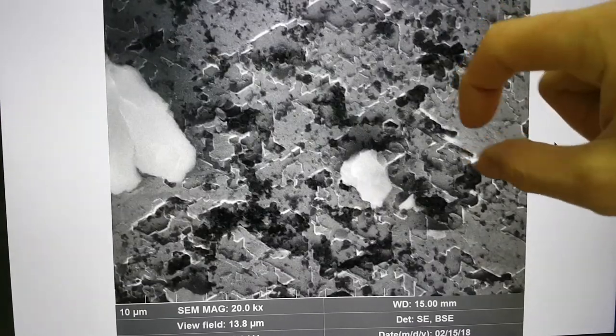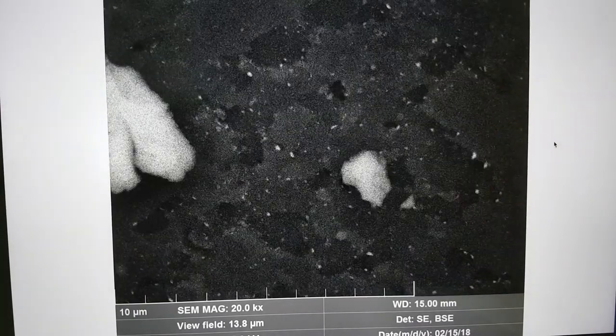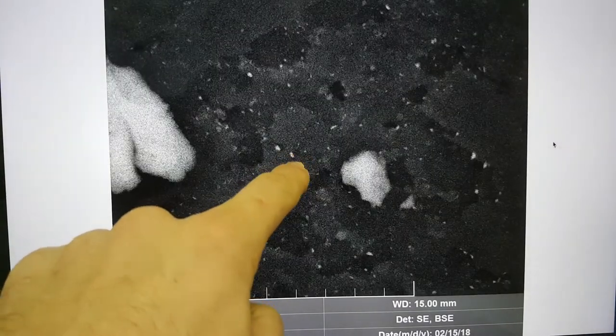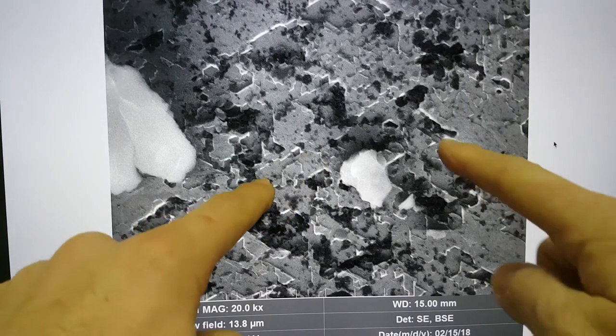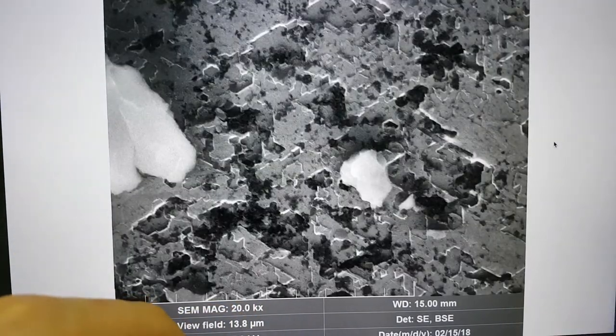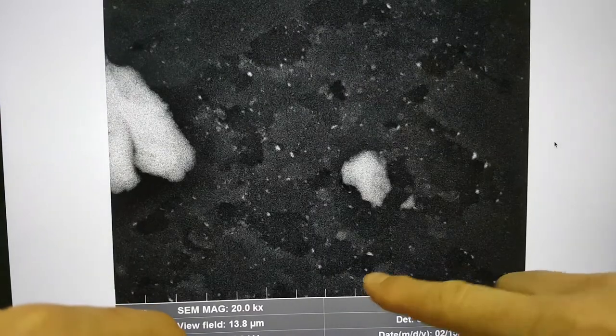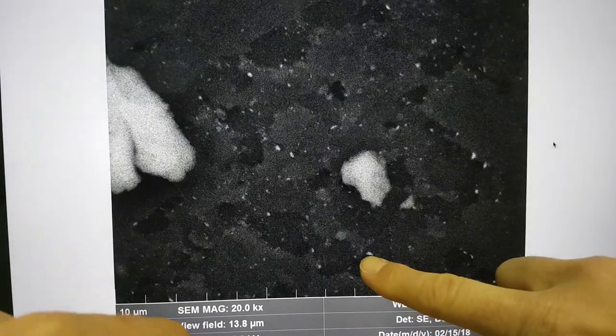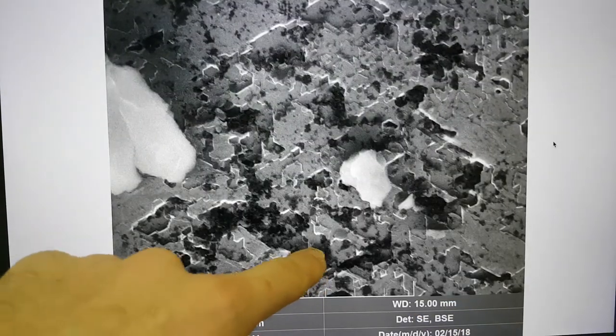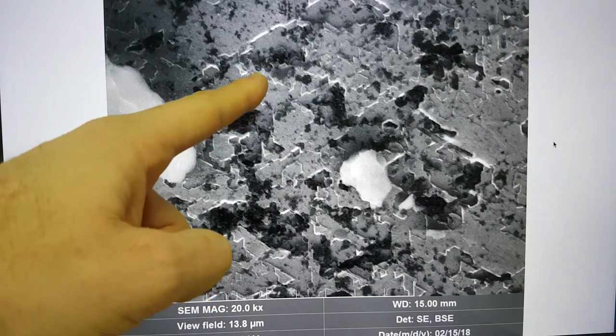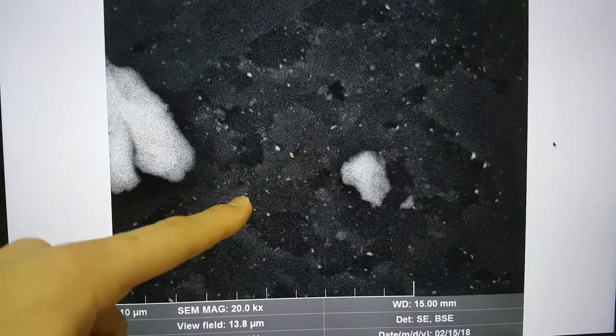On the leading edge there is what appears to be a different element. It's kind of like a field with combine harvesters. One, two, three combine harvesters harvesting the carbon. Over here you can see there's a hole and at one end it has this. This is going in this direction, this is going in this direction. It can really work in any direction. This looks like it's eating up this way, this one's kind of eating over this way.